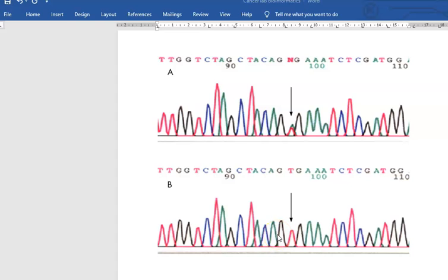Okay, I hope that all makes sense. The beauty of doing it this way is, as I mentioned, there is specialist software for doing genetic analysis. When I'm designing primers, I tend to be doing it without access to any specialist software. I like to be able to just access NCBI Gene, mess around with the sequences and use any free open access software. So that's why I show you how to do this, because I know you'll be able to do it from home. You won't need any specialist DNA analysis software, and you can access everything freely. All of the resources I've just been on are completely freely accessible from any computer anywhere.